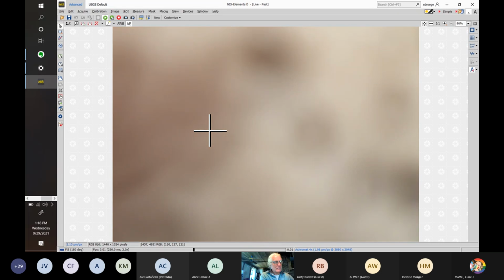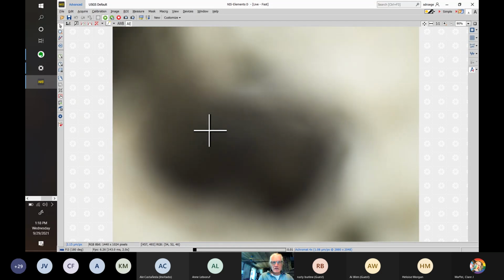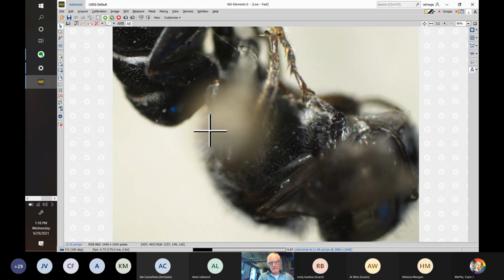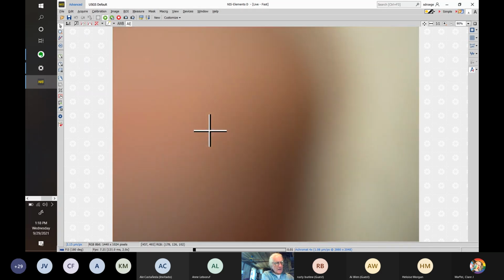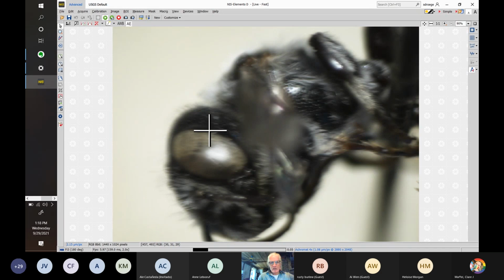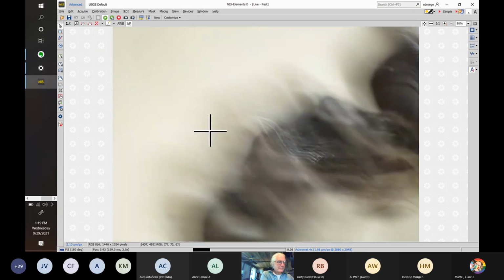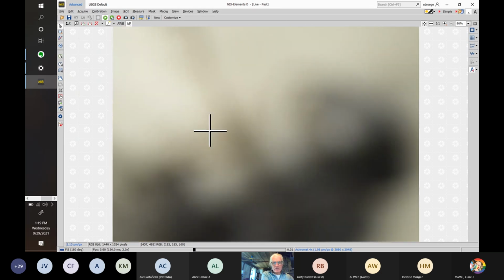I'll try one more time on the other side with this extra light the microscope has given us to see if we can't pull out that line at all. You can't if there's a wing in the way. Yeah, I'm afraid right now the wing is hiding, is in front of the area that we would want to see. Anyway, so this is a male. It does have that same feature. Let me try from the top one last time on that side.